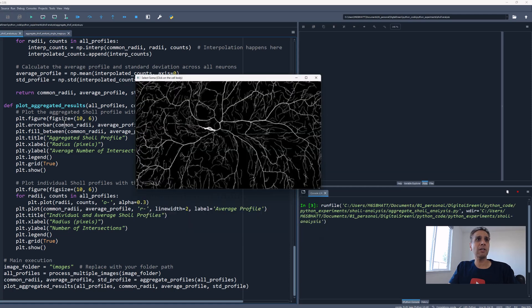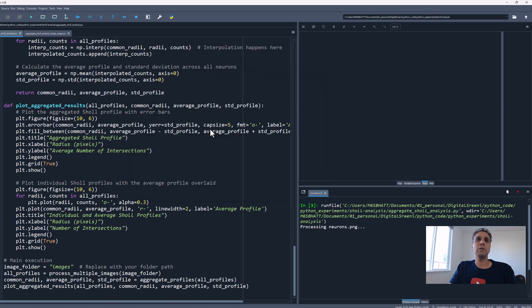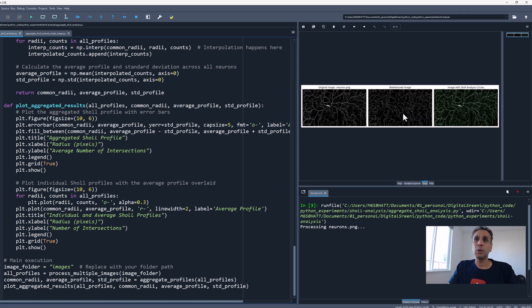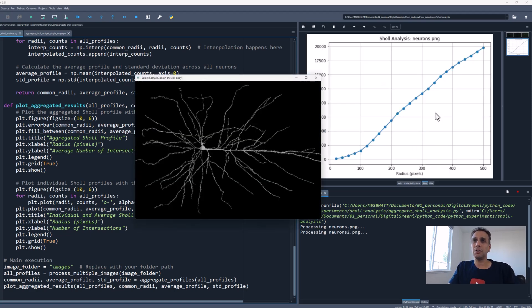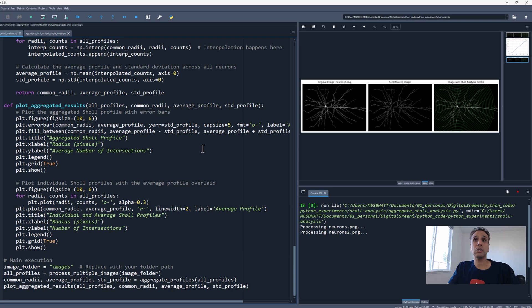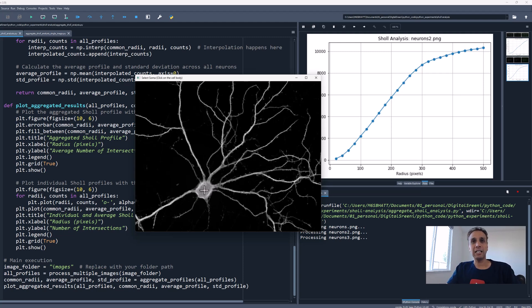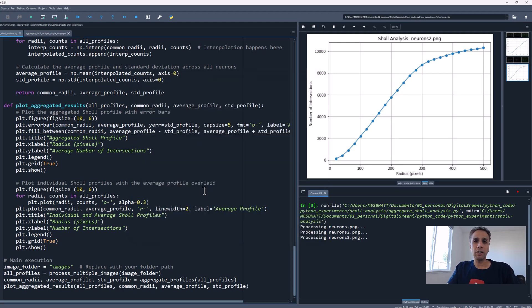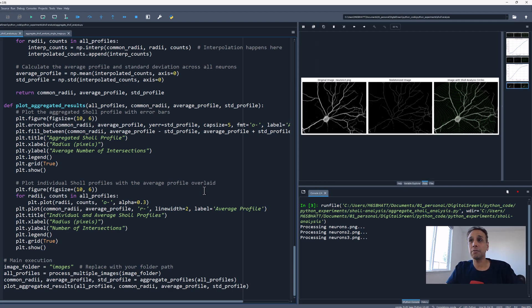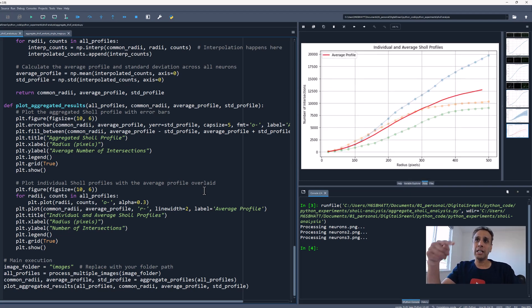Let's go ahead and run this so you see exactly what's happening in action. I should have actually selected different radii for each of these, but I'll leave that to you. You see how it's opening an image right now. Let me define the soma location. Now you should see some plots here because I wanted to see those before selecting the next soma. There you go. Once the analysis is done, it's opening the second image. I wish all of this was fully automated. Detecting soma using traditional methods is challenging. Detecting soma using deep learning where the images look this different—you see how large this is, this is high resolution image—it's not easy if you're working with a bunch of images all similar, collected on the same instrument, all similar, then this is easier.